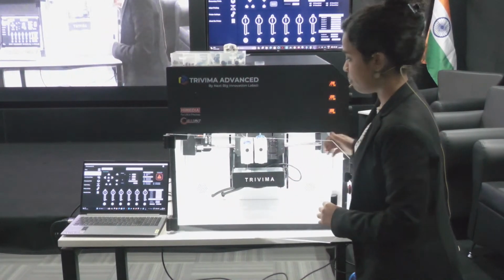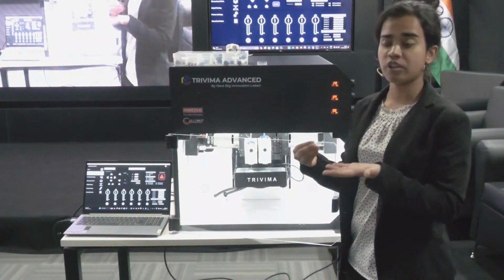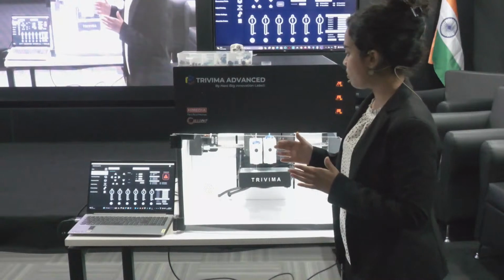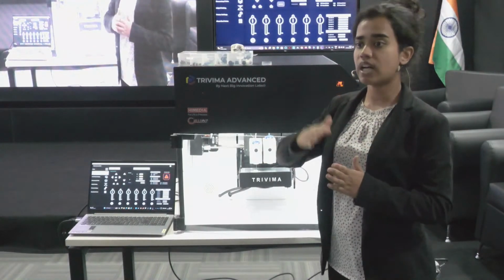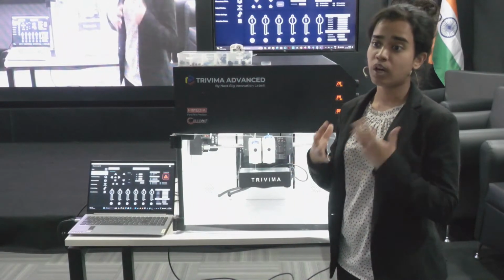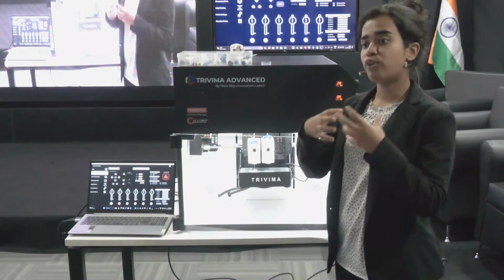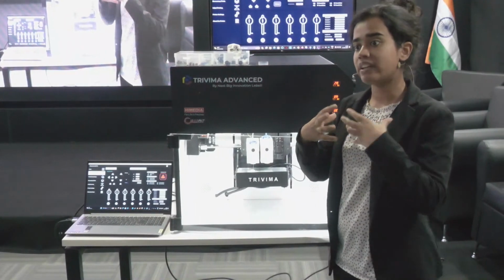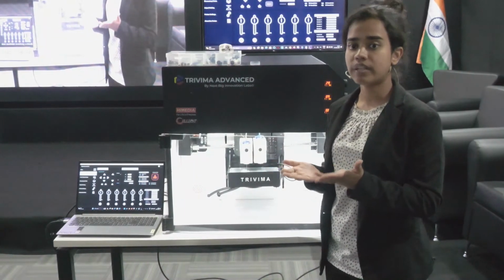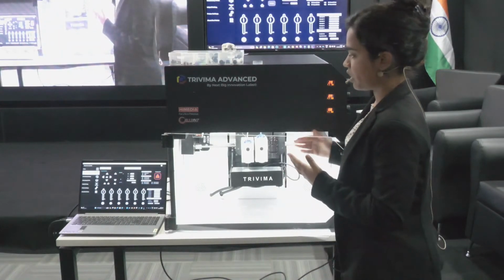Now this is the print bed. So this is basically, as the name suggests, the bed onto which you print your bioink, right? This print bed is also temperature controlled, from 4 degrees up to 80 degrees Celsius. That is utilized in certain hydrogels that can be thermally cross-linked. You would need heat for the hydrogel to solidify, for it to increase its mechanical integrity and retain its shape. In those cases, you would need the print bed to be set at a certain temperature before printing.